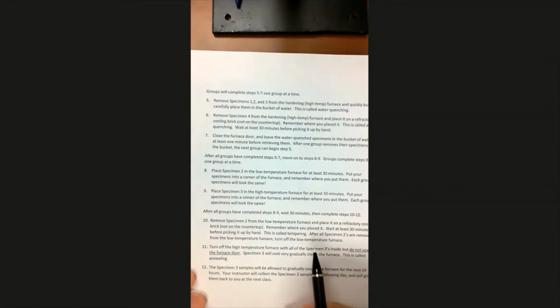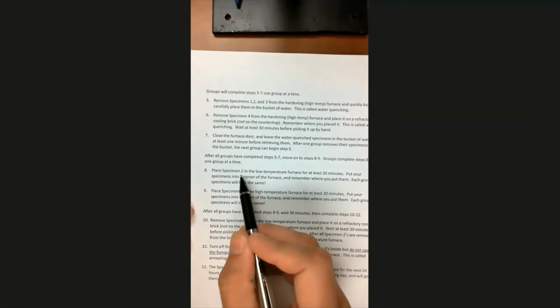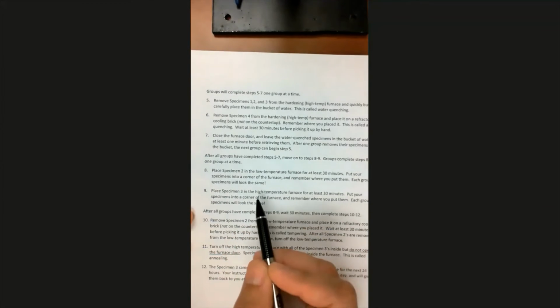So at this point, we've got specimen 1. We can take it out of the water. It's been cooling down in the water, so it's cooled down. Specimen 4 is still hot, but it's being air cooled. And specimen 5 and 6, remember, we're not doing anything in this procedure with specimen 5 and 6. And 2 is in the low temperature furnace, and 3 is in the high temperature furnace.